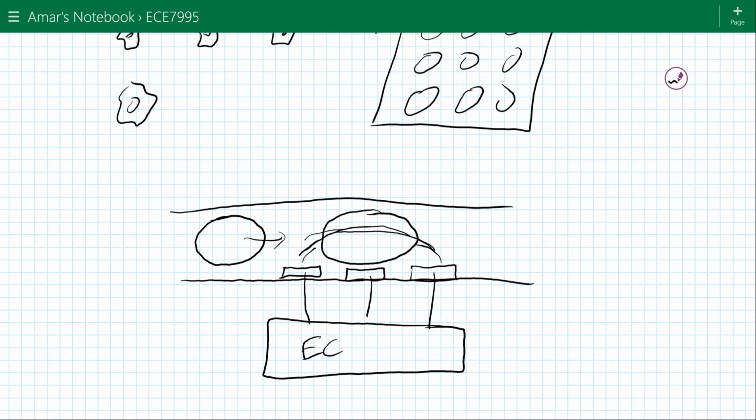When a cell goes by, it changes the electrical resistance. So this is where you're using electric fields to actually count the number of cells as they go by this section of the channel. Again, the advantage of doing this in a microfluidic device is that the cell is the same size as the channel. So it really is covering up most of the channel, so it causes a large resistance change.